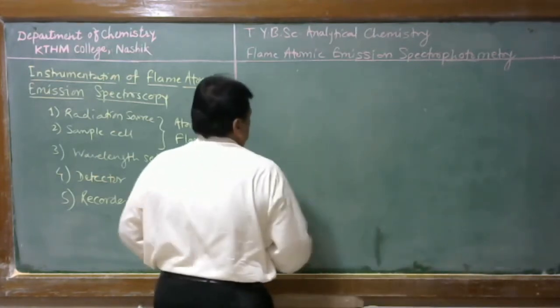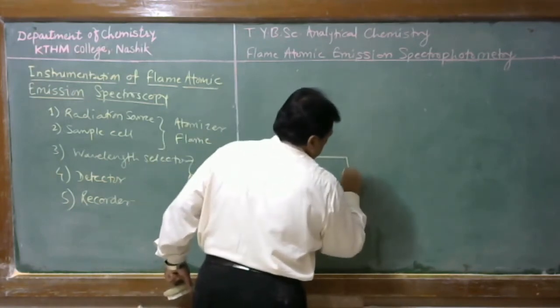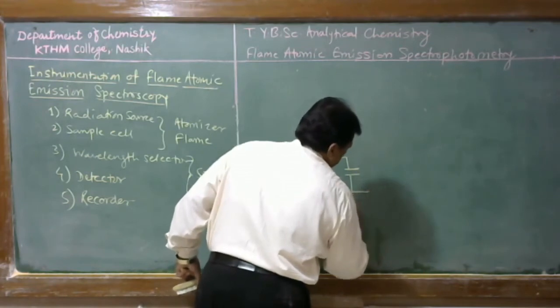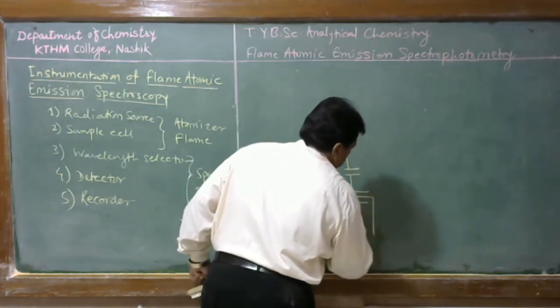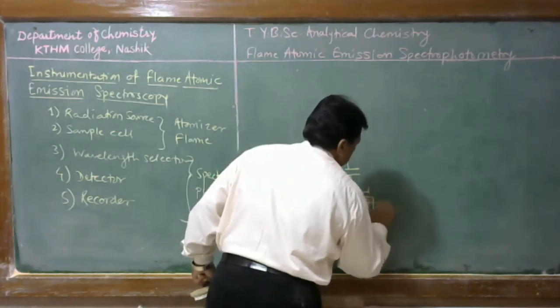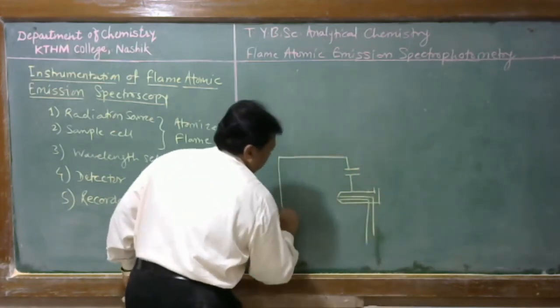Therefore, here there is an atomizer and burner system. To vaporize the sample as well as to atomize the sample, there is a requirement of fuel gas and oxidant.